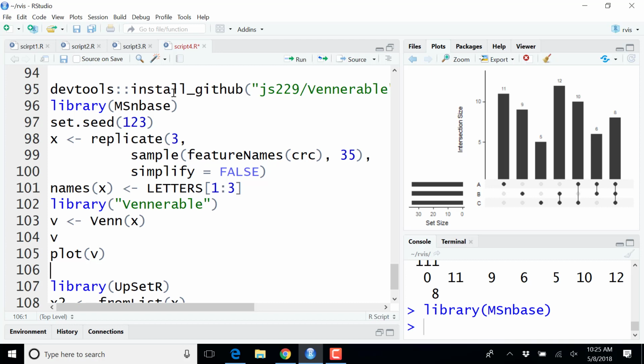Or what you can of course also do is to use the CRC data set, at least the one in the long format, because the CRC data set is in the wide format, so there you would need to extract the column names of interest. But if you have the one in the long format, you could use that protein column. But don't forget to say unique, please. Then you take the unique protein names, that would also go.